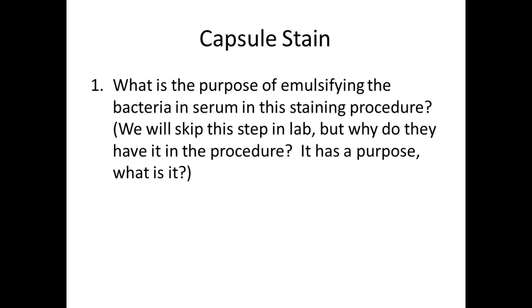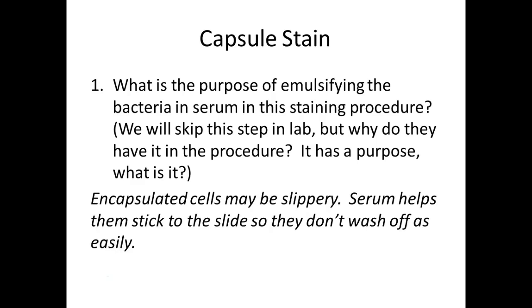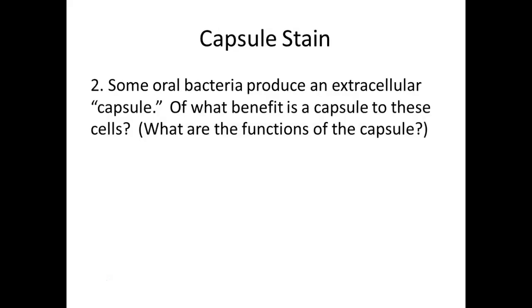The other thing in the procedure that we do not do is we don't use the serum. Why do they say they use serum? To help it stick. And again, we do not heat fix these slides in this procedure, because you could distort the capsule layer. Remember, heating will shrink and affect things.